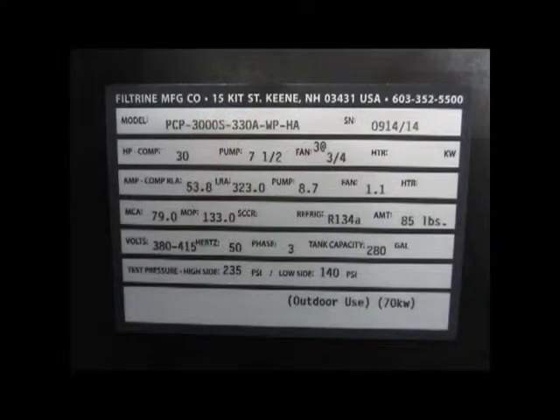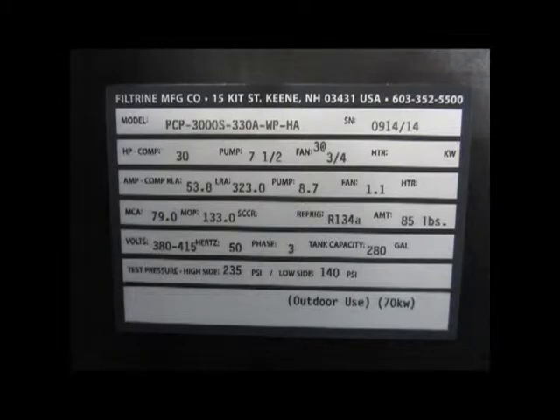On the back side of the electrical box door, each unit will also have a unit tag. This tag will identify the serial number and model number of the unit, along with performance and technical information on the chiller. A copy of this tag can also be found in the manual.